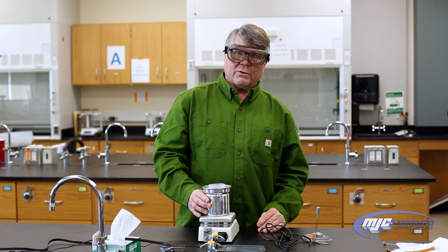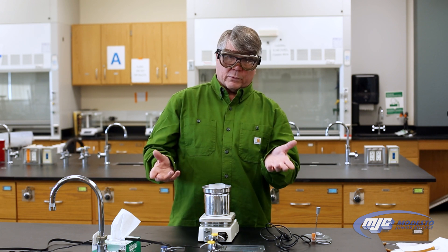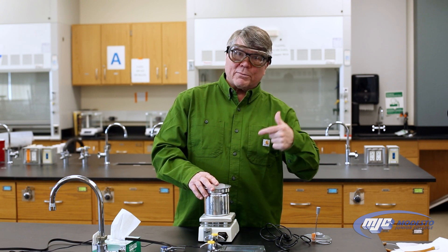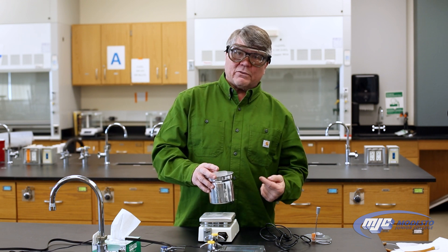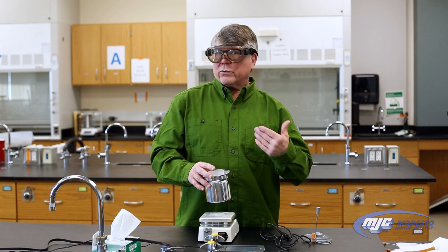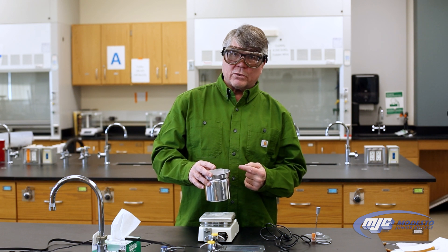The other thing about these calorimeters is that a lot of times the first thing we do in an experiment is to determine what's called the calorimeter constant. The calorimeter constant will be different for each calorimeter, and if you're going to use one another day, you need to know which calorimeter you used.